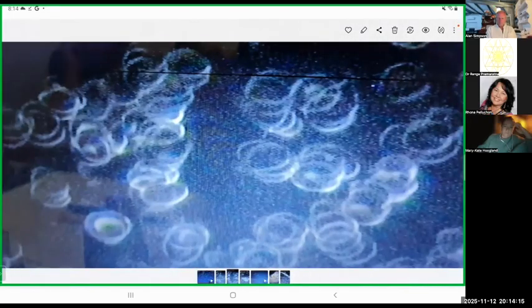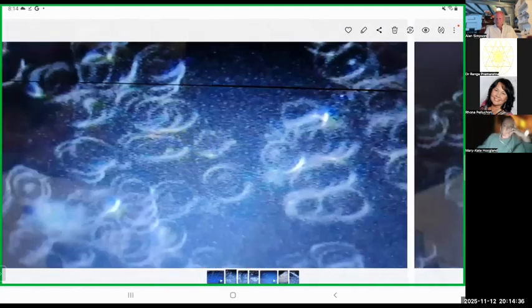This is red cell aggregation. You can see cells packing up. This is like medium rouleau, rouleau meaning stack of coins. And you can see on the left side, there is a cell. Some cells look like there's an inner ring, and that is when hemoglobin gets oxidized. When that happens, oxygen cannot bind, so oxygen levels drop.